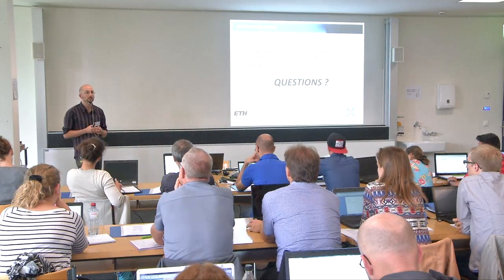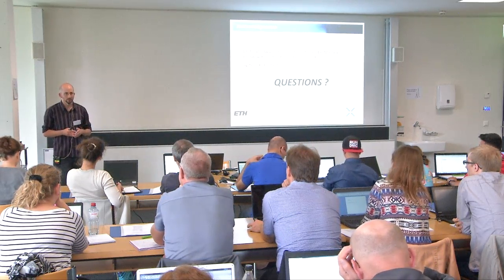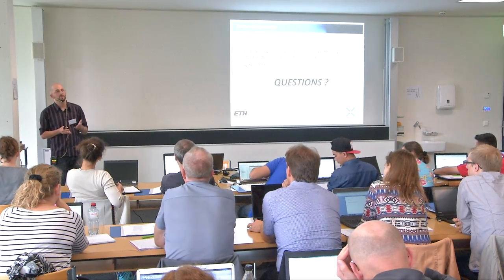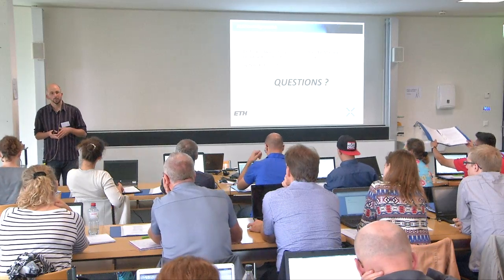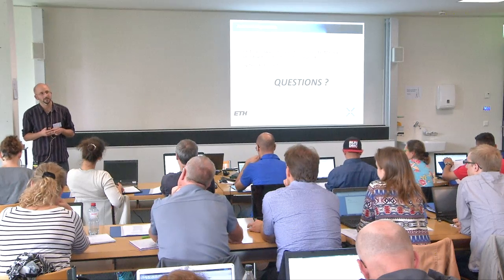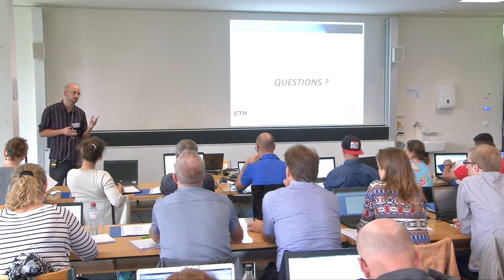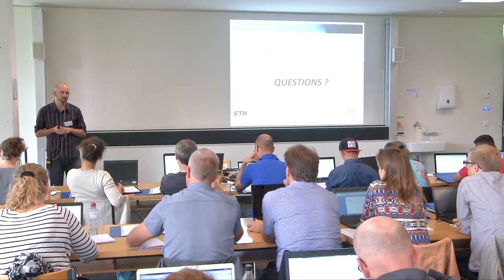It depends a bit on the setup of the machine. Usually we start to work only with the Y-ions, but sometimes B-ions are very informative and we still try to use them, and sometimes they're also very intense. Particularly, or unfortunately, depending how you look at it, smaller B-ions can sometimes be very intense, such as B3 or B4, because the B-ions continue to fragment.